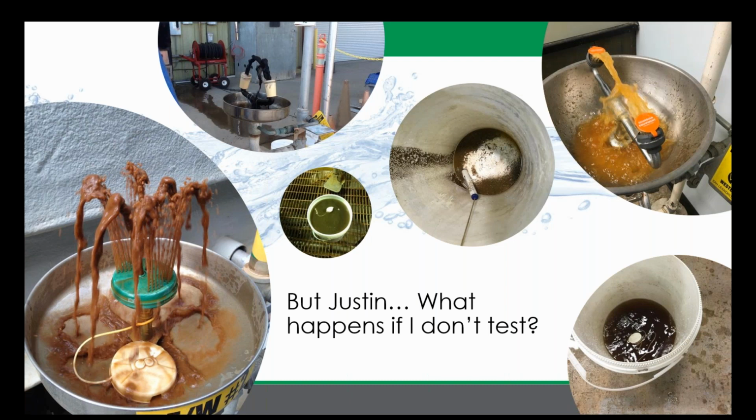It is important to remember though that if you've been exposed to something real nasty, corrosive or otherwise, in your eyes or face, it is important to just use the nasty water, unfortunately. Better to deal with that later and get the nasty stuff off of you immediately than to cringe and say, I'm not using that, and deal with the ramifications of not getting the dangerous chemicals off of you.